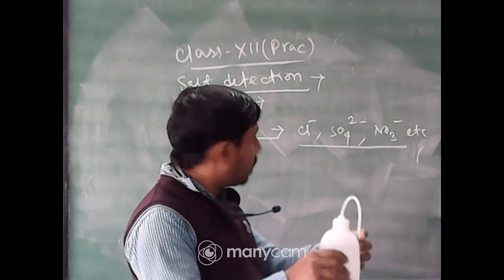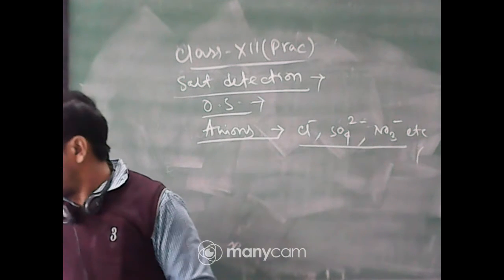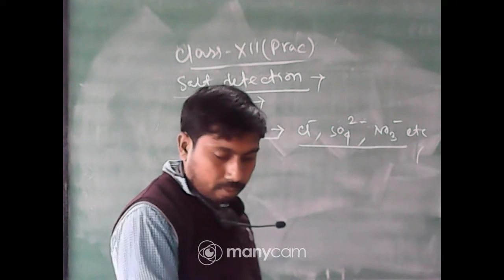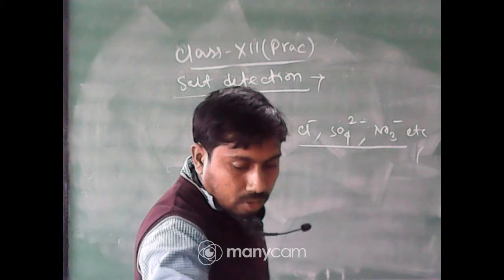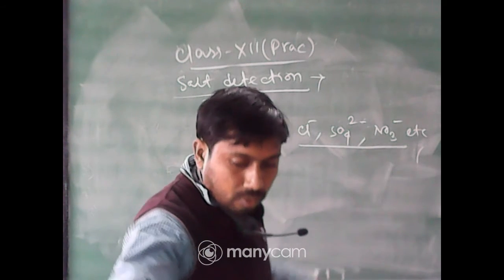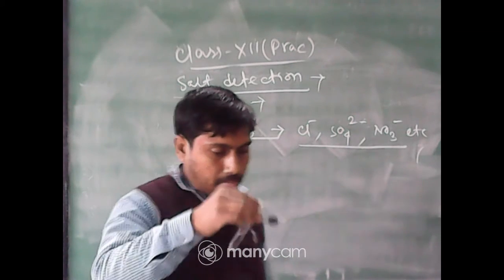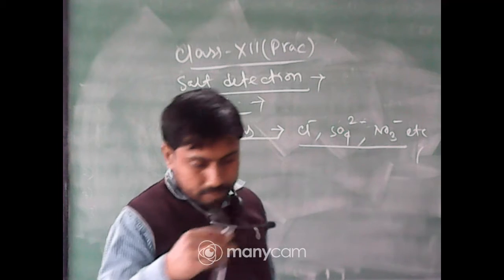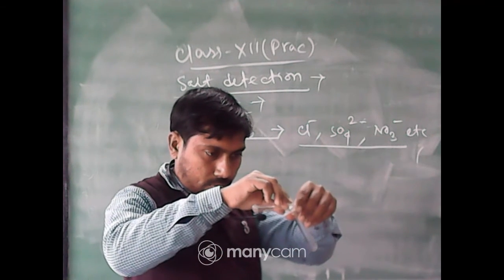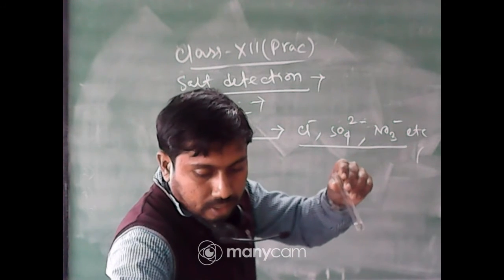Now we will test for the last one, that is nitrate. For nitrate, again the OS will be taken in a test tube. This is the OS taken.